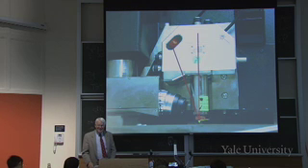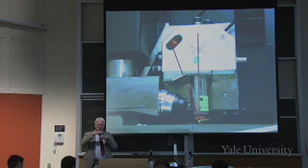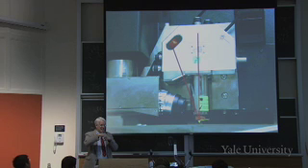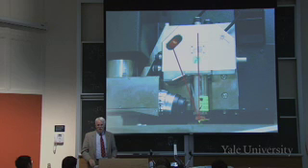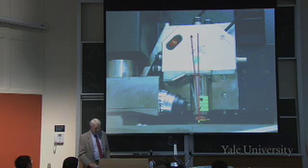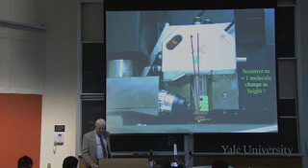Isn't that neat? So now what you do in this is move this back and forth over the sample and watch the little needle go up and down by the reflection of the light. So if the surface was like this, it'll go click, click, click, click, click, click, up, up, up, up, up, up, right, as you scan across, right? And it's sensitive, as I say, to less than 1 molecule change in height.